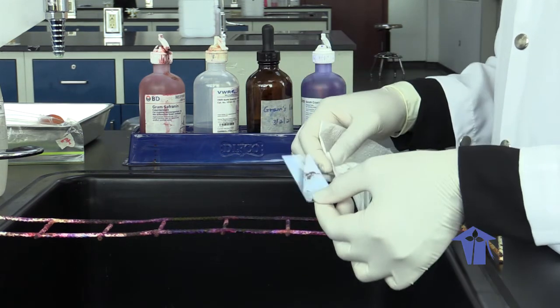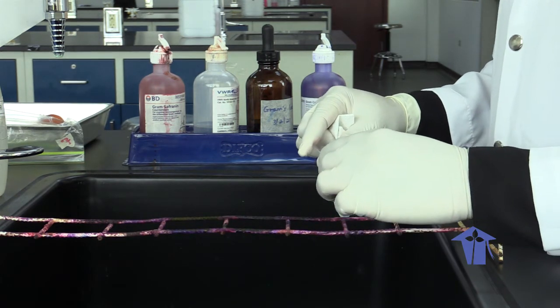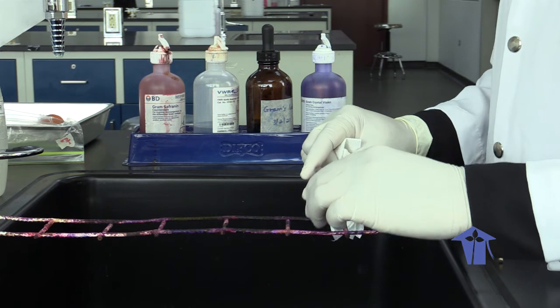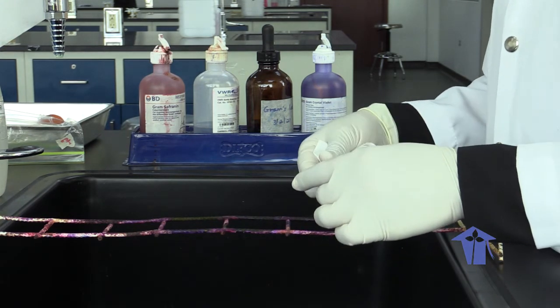So your gram stain has been completed. Now you're going to take your sample, put a cover slip on it, and look at it under your microscope to see what morphology or what morphological characteristics this organism is displaying.